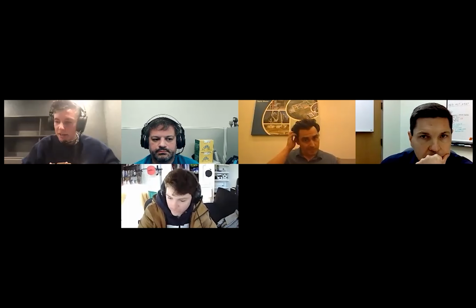Just to segue from there, because we seem to be getting a lot of questions towards the beginning of the workflow, specifically with the auto sampler that I think all 3 of you guys incorporated into your workflows. Have you guys by any chance incorporated anything to account for viral degradation that may be present at that step, if there is some? I know groups are slightly worried that if they are collecting over 24 hours, water collected toward the beginning at time 0 might degrade, and that's all dependent on whether it's a viral capsid or free RNA at that point.